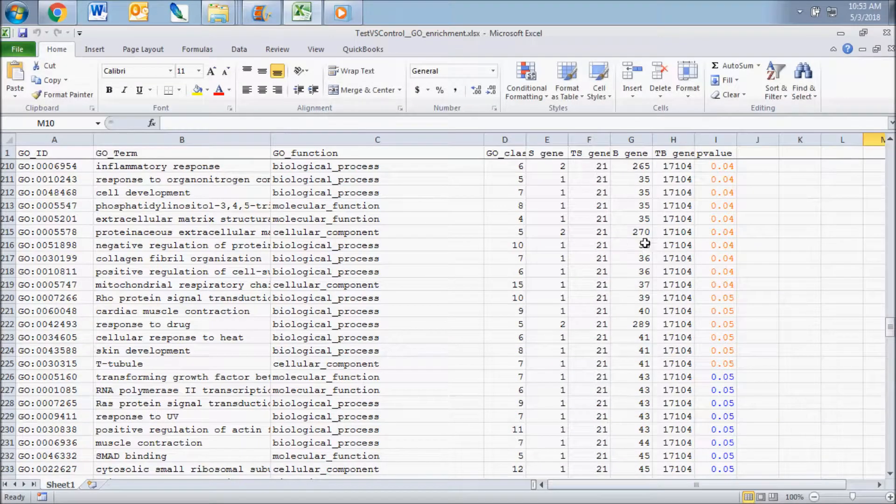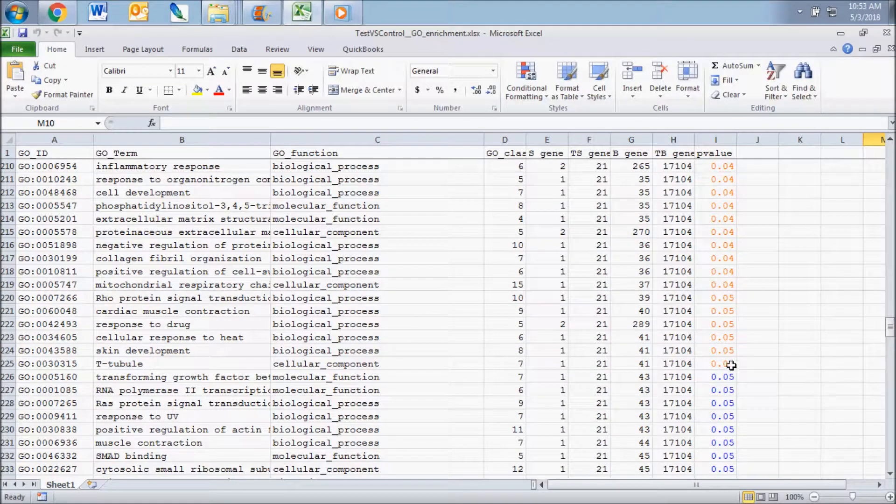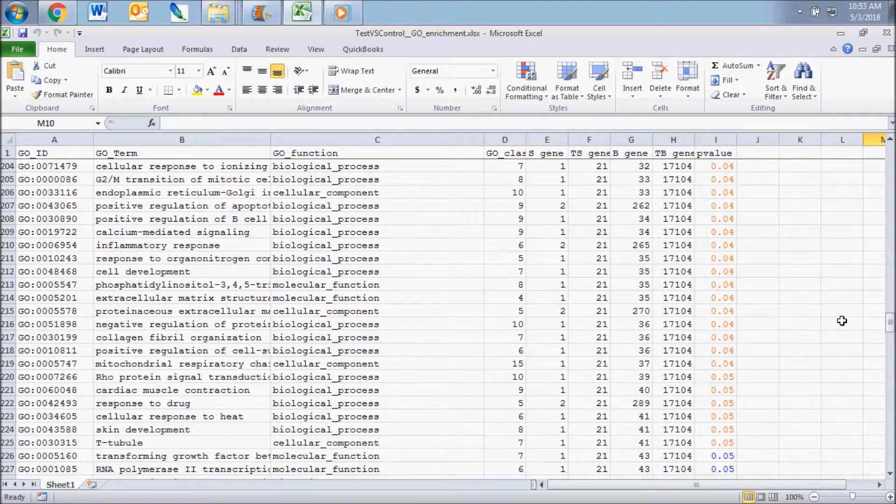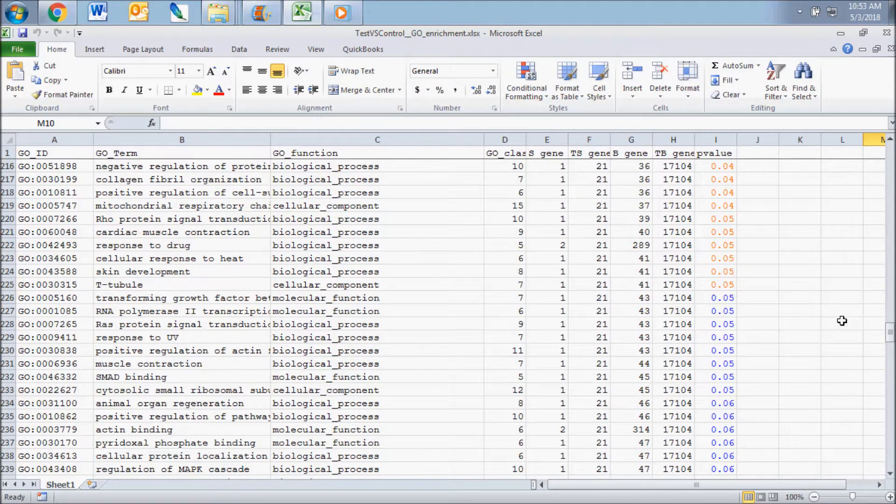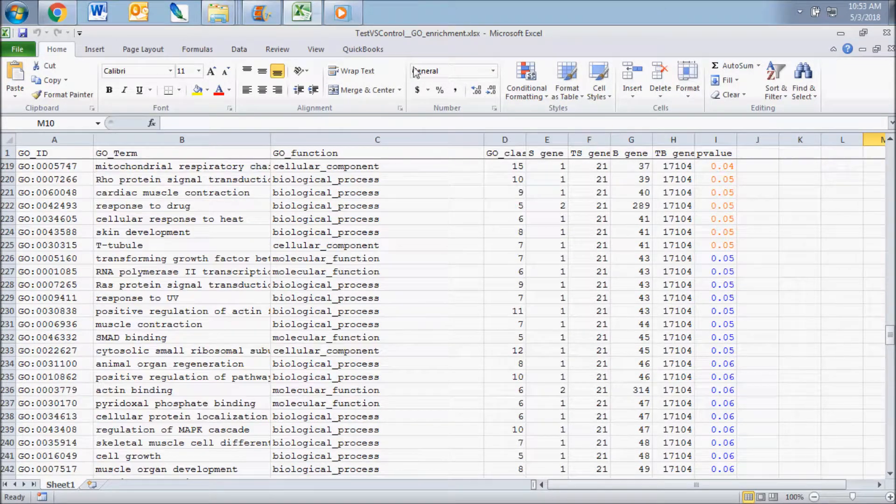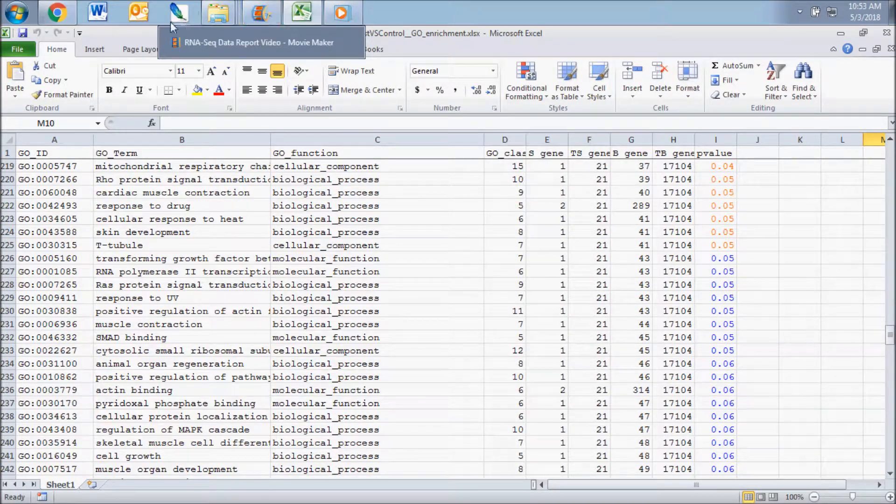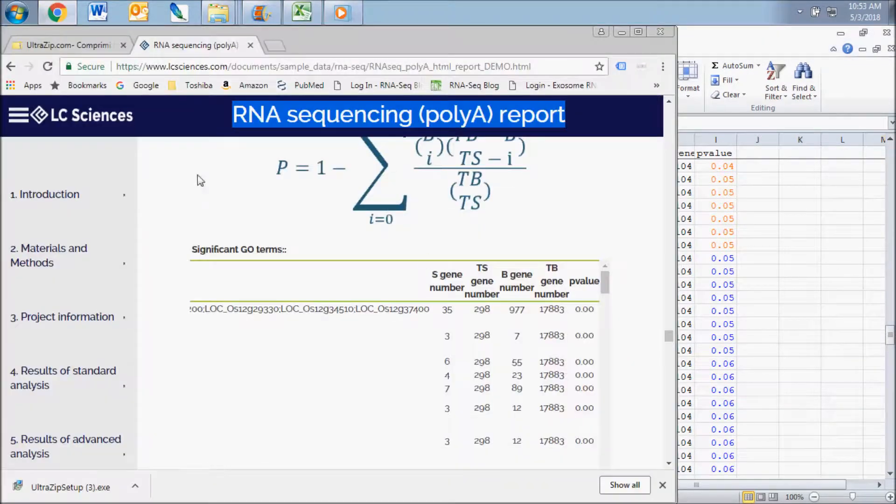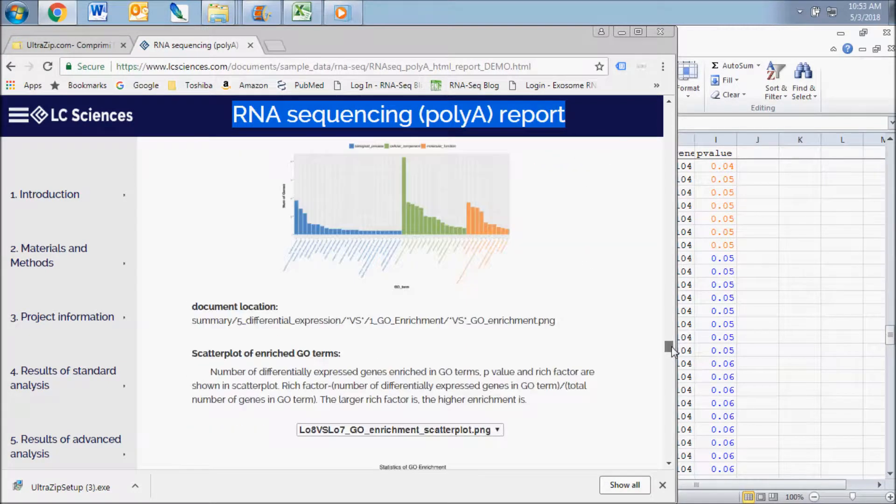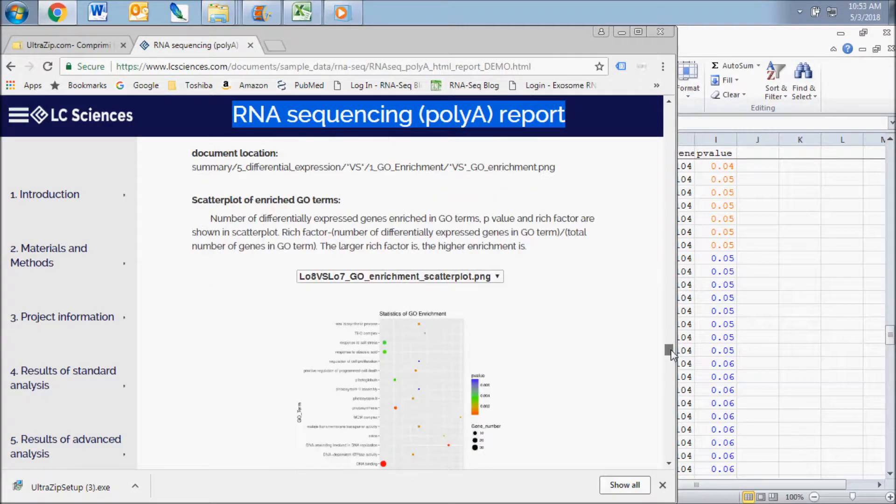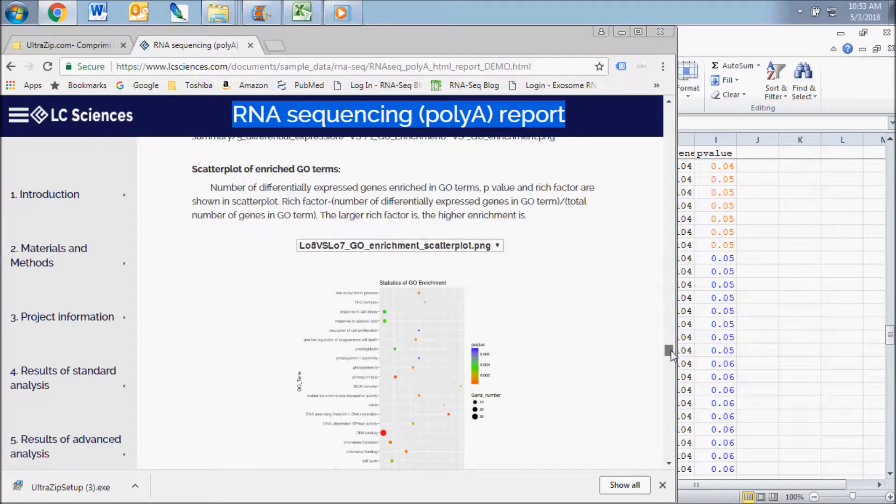Those GO terms with p-value less than 0.05 were defined as significant GO terms. A bar plot and a scatter plot are included for a visualization of the GO enriched terms for each comparison.